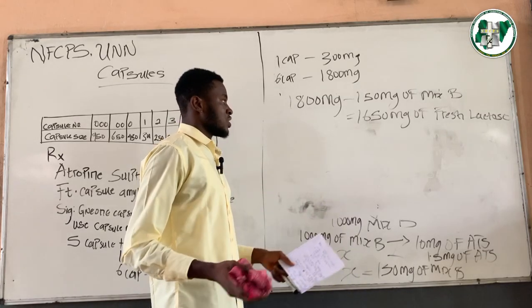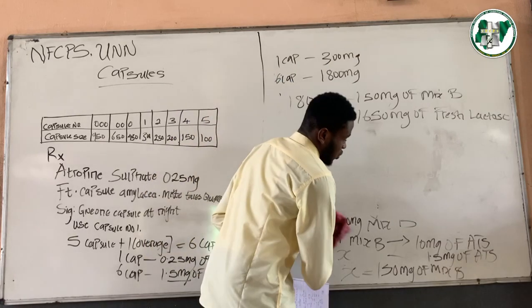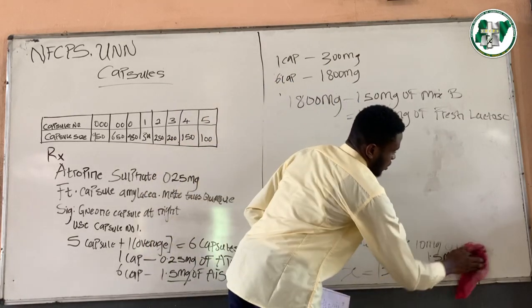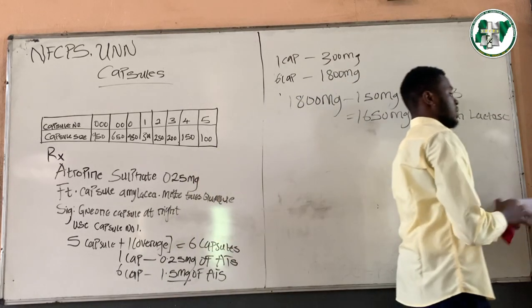So I'm just trying to paraphrase this, but the procedure is what you must have already mastered by now. So this I just link practically with the calculation questions. Our label is going to be like this.